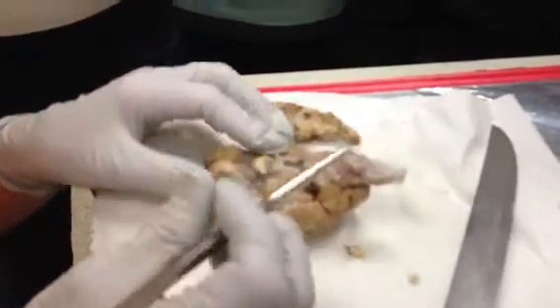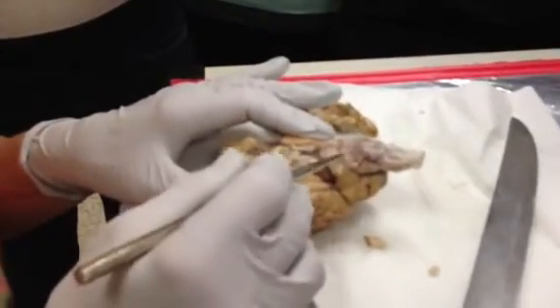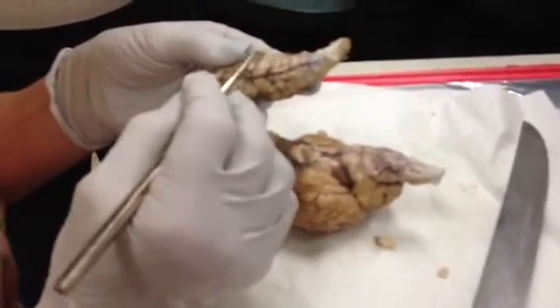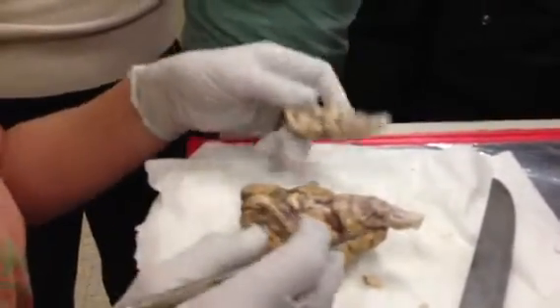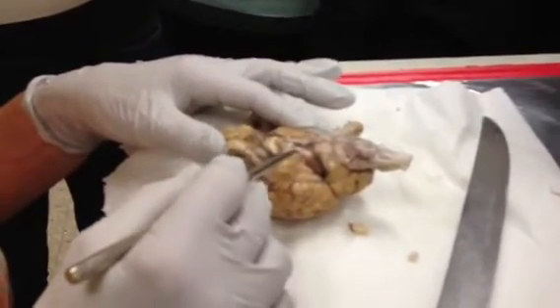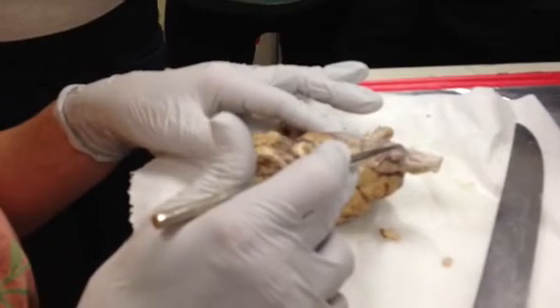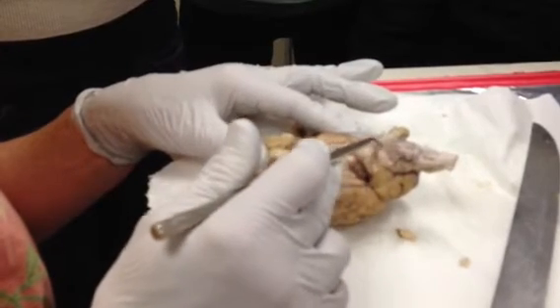Okay. And remember that was on that piece of dura that we had. And I don't have any abducens to speak of. The abducens would be right here and right there. Notice it would be right between the pons and the medulla. Okay, so lateral to oculomotor is going to be our cerebral peduncle. This is our pons. From here to here is our medulla. This is our spinal cord. This is the ventral median fissure.